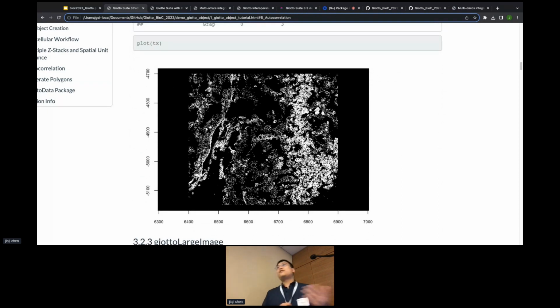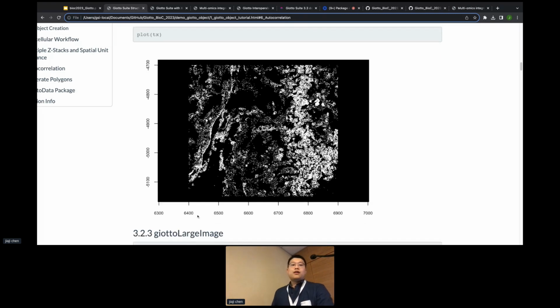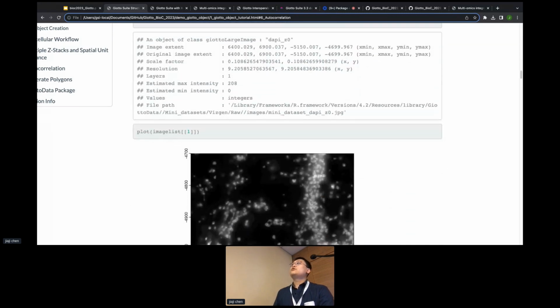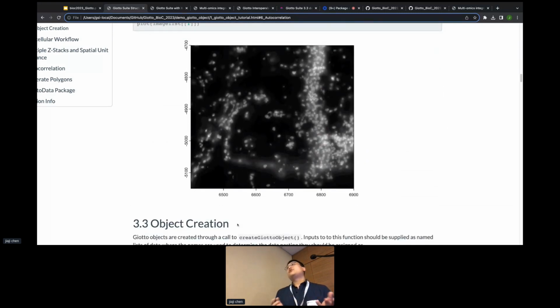Since a lot of this already builds on a pre-existing framework, we are also able to port over a lot of the functionality for things such as spatial manipulation, flipping, XY translation, rotation, for SpatVectors specifically anyways. Then we also have the images themselves, which are very efficient in terms of how much memory they take in the session, and they also plot very quickly because it only grabs the pixels that are needed to actually make the plot itself.